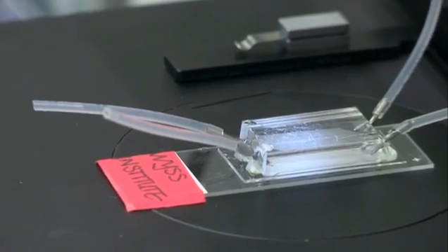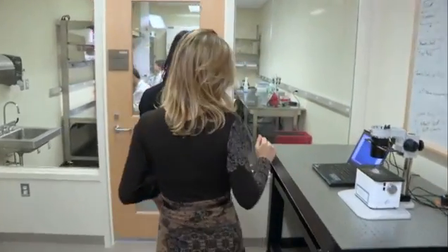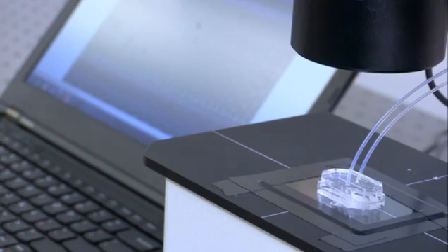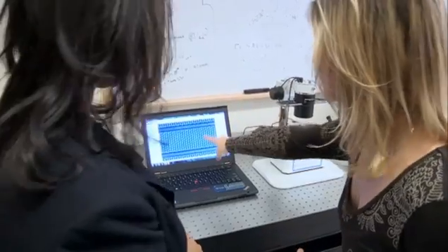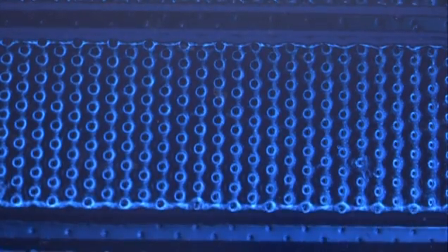Now we're in the engineering area and we're going to show you one of the things that our engineers made for us, they designed and made. And this is an actual lung on a chip. And what you can see here is a lung on a chip breathing. It's actually contracting and relaxing.